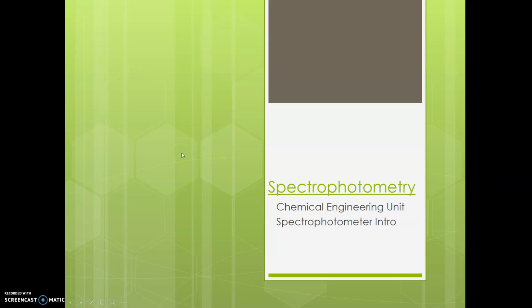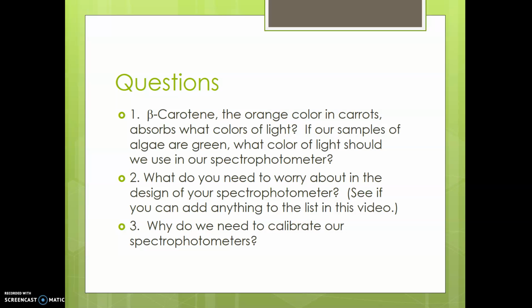Today, what we're going to be talking about is spectrophotometry. This is going to be found in a lot of chemical engineering and biological engineering applications.